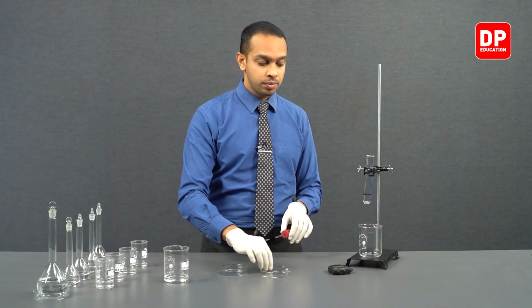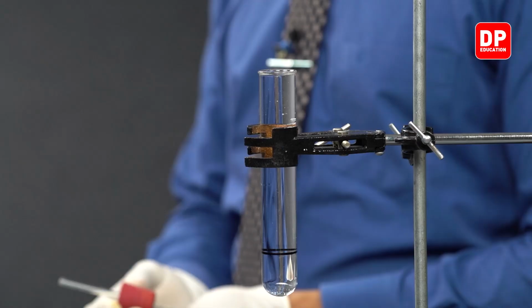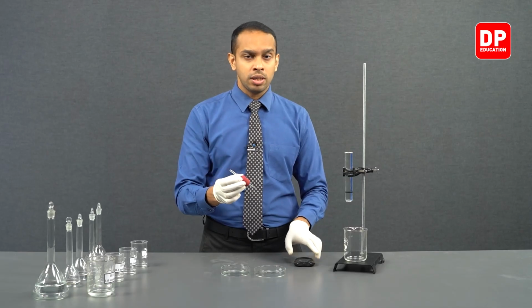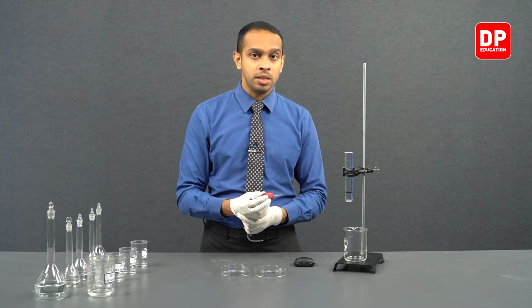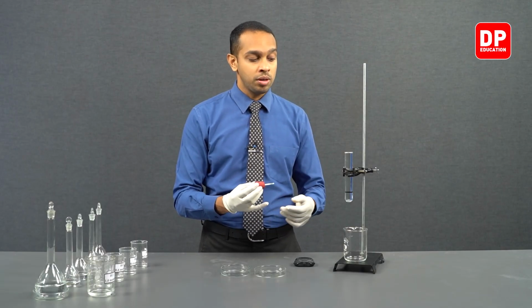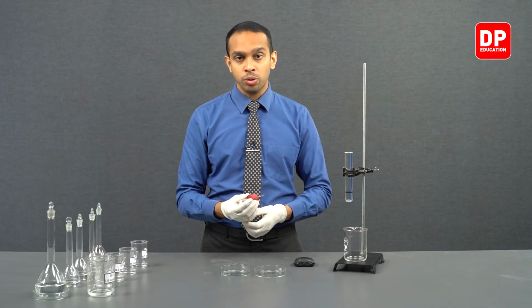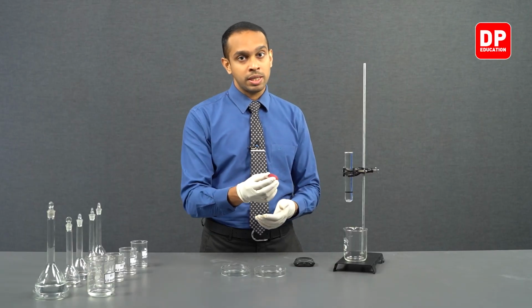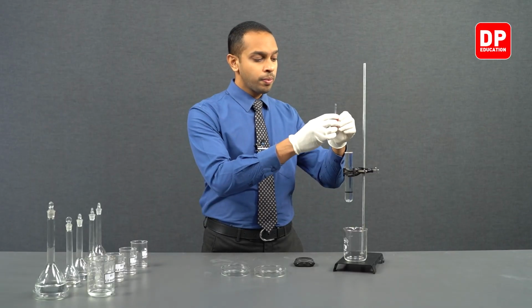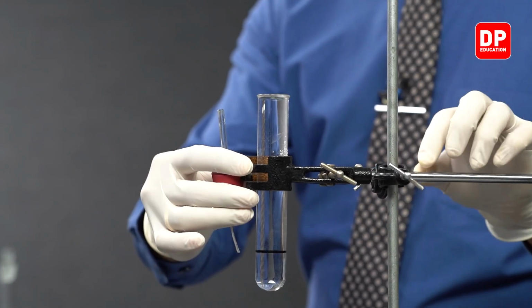After doing so, we will be inserting this rubber stopper and starting the stopwatch as soon as we turn the boiling tube upside down. If you are conducting this experiment in the lab and you have a lab assistant, you can get your lab assistant to do this, as it will be difficult for one person to place the rubber stopper and start the stopwatch at the same time. However, if you are doing it on your own, as soon as you place the rubber stopper, turn it upside down and quickly start your stopwatch. So we are going to be doing the same few steps that we have done in the previous experiments.